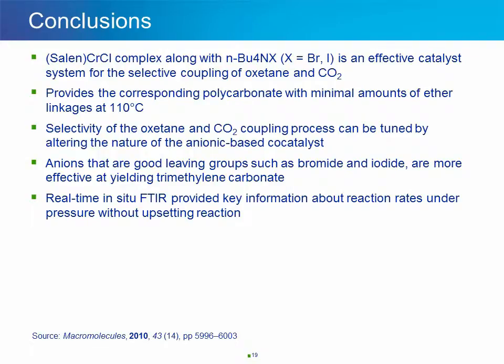Furthermore, at lower reaction temperatures, temperatures less than 80 degrees C, the catalyst system is capable of producing polycarbonate directly from ring opening polymerization of preformed TMC via a coordination insertion pathway. I will conclude by saying that real-time in situ FTIR played a crucial role in understanding reaction mechanism and pathway by allowing the researchers to collect valuable information about reaction kinetics and the rates of formation of the TMC and poly-TMC in a pressure reactor without having to perturb the reaction and upset the reaction conditions, which happens when taking samples for offline analysis.